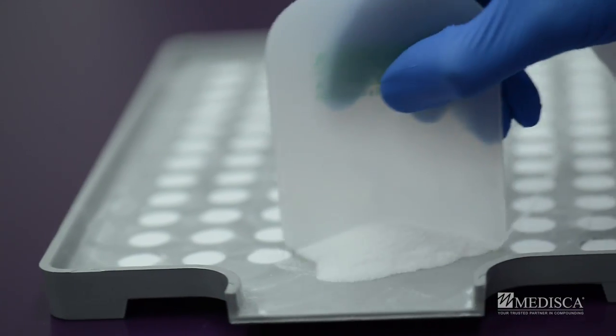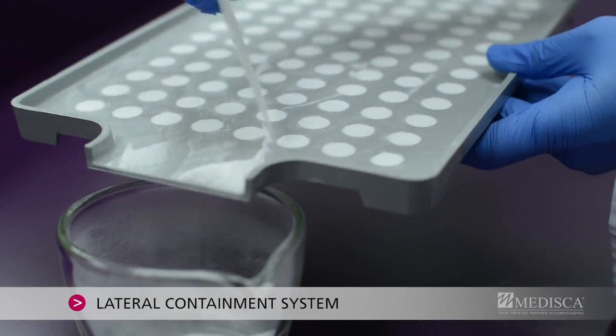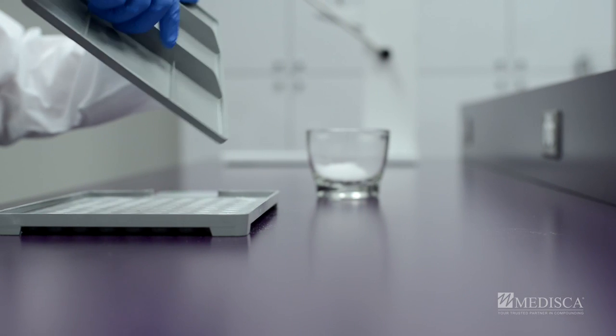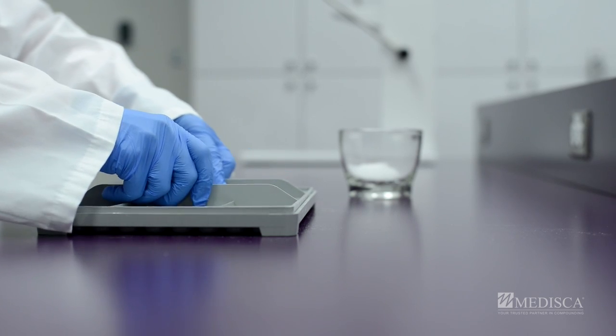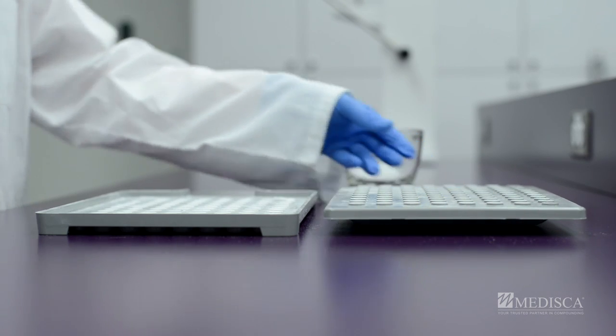Remove excess powder through the lateral containment system, a unique feature which helps to avoid powder loss and facilitates the filling process. Apply the top compression plate to compact the powder in the cavities. Remove the top plate and repeat the filling process at least two times to make sure the cavities are completely filled.